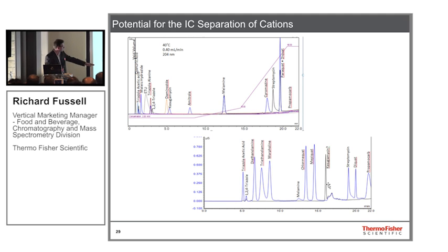And then in the other one here is some of the same compounds, but just different conditions. So you can see under these conditions, we've actually managed to move the triazole metabolites with more retention. So we're still developing this method, but it's quite possible that we can get many of these compounds into one single multi-residue method, chlormequat, mepiquat as well. Okay, but this is the very first chromatograms.